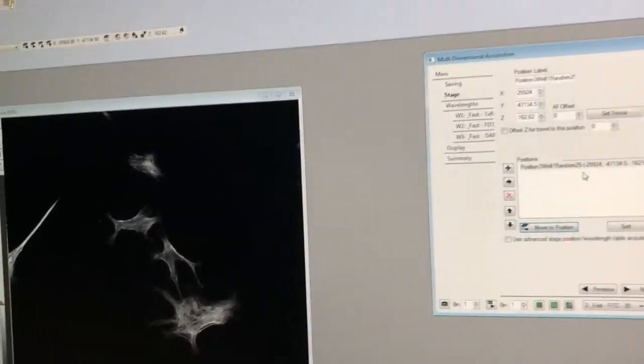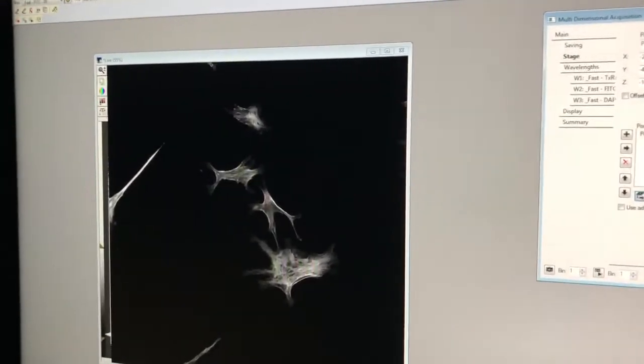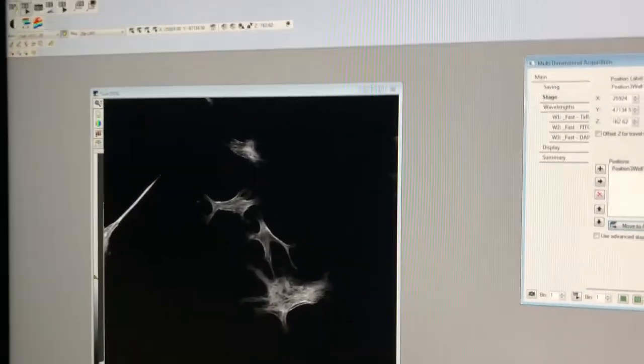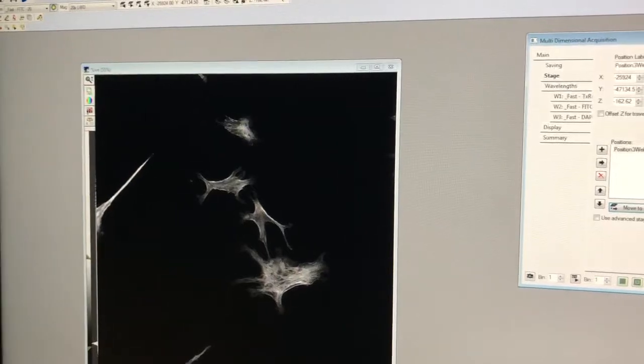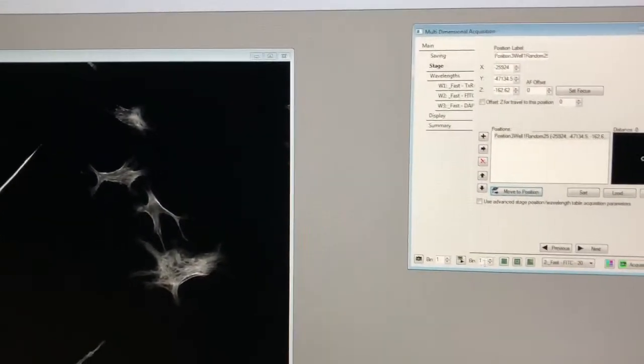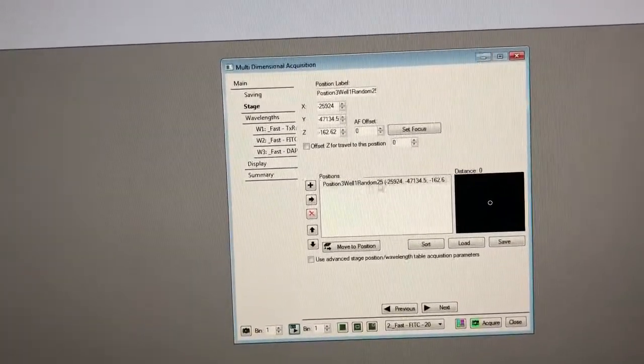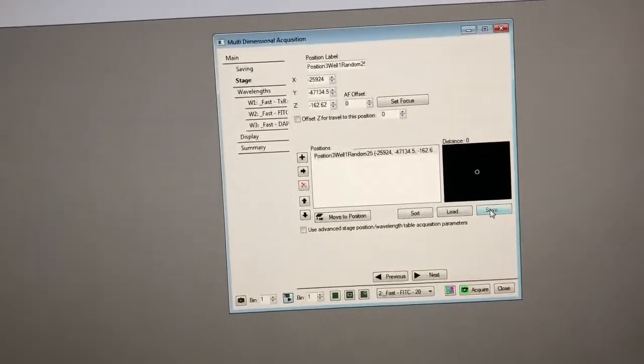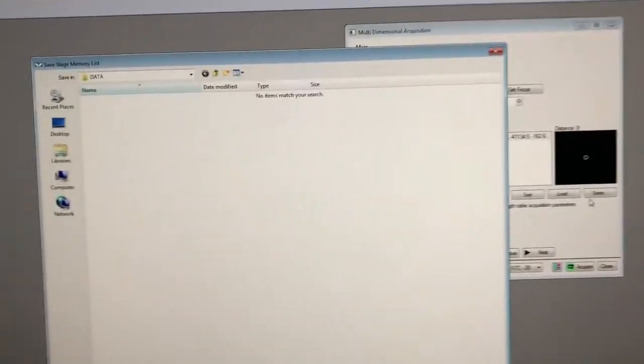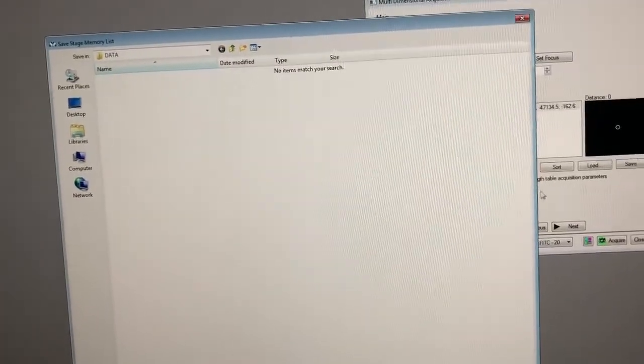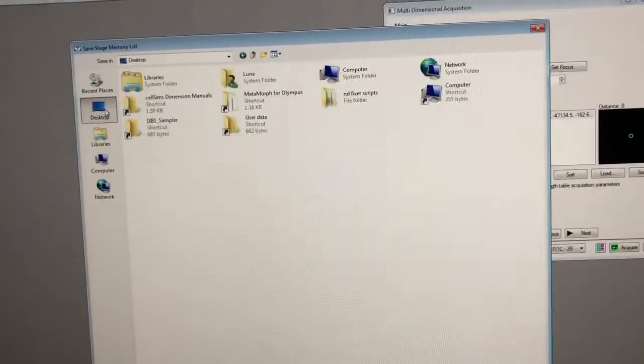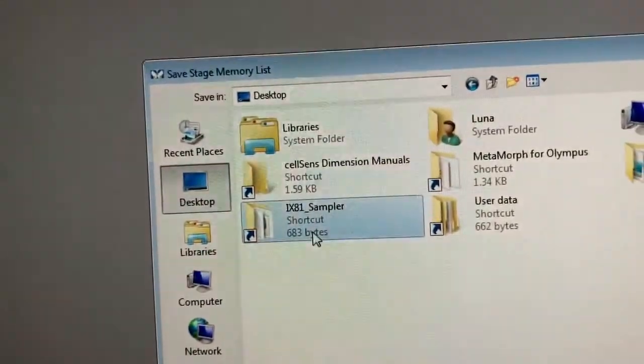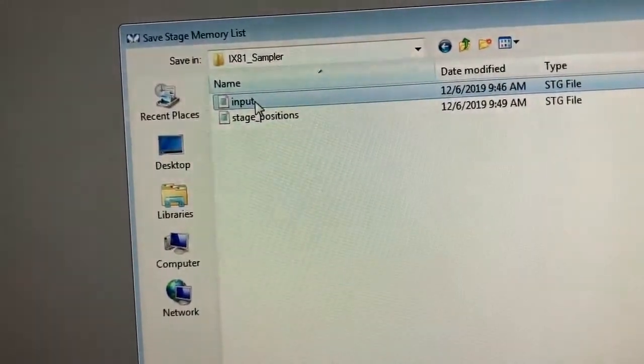But right now what we want is to use this feature so that we can do random sampling. So a truly representative set of images from our sample. So how do we do that? So what we need to do is once we've saved, once we've marked a position we need to save this. So we're not going to save this any old place. We're going to save it in a special folder in the desktop called ix81 sampler and we're going to save it and call it input.